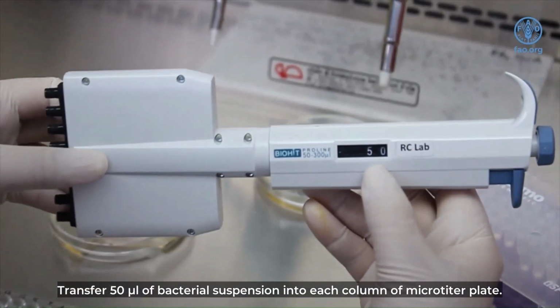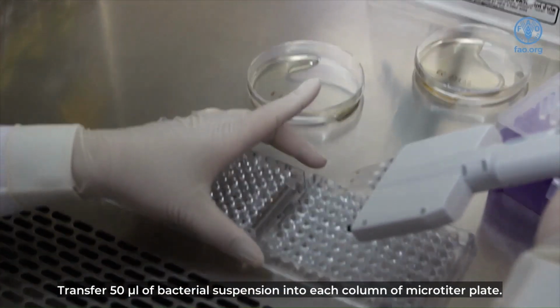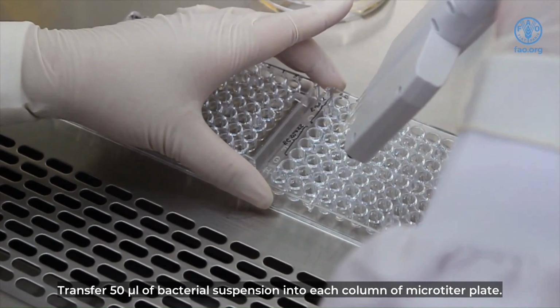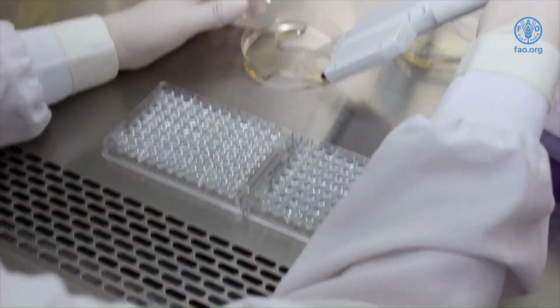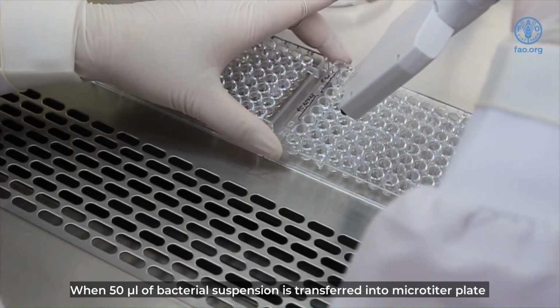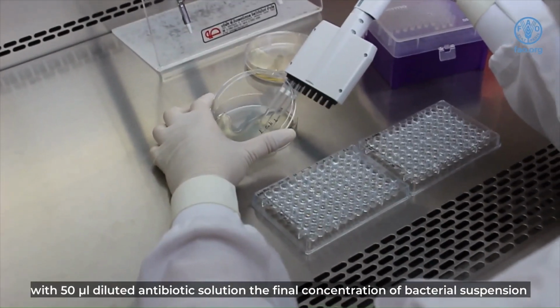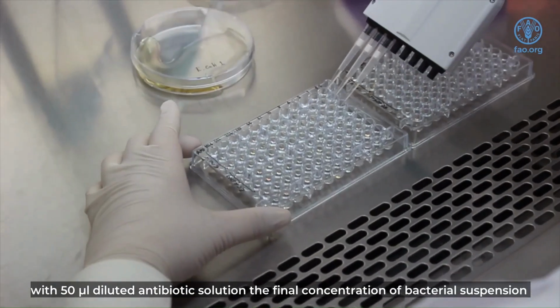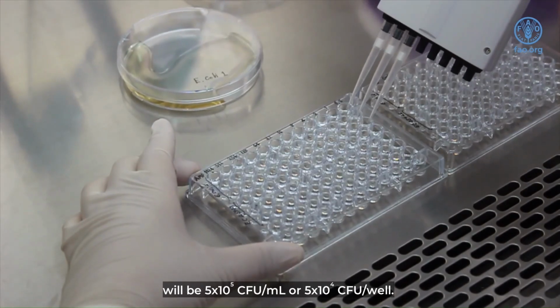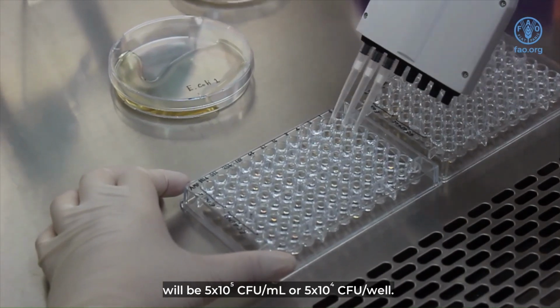Transfer 50 microliters of bacterial suspension into each column of microtiter plate. When 50 microliters of bacterial suspension is transferred into a microtiter plate with 50 microliters diluted antibiotic solution, the final concentration of bacterial suspension will be 5 times 10 to the power of 5 CFU per milliliter, or 5 times 10 to the power of 4 CFU per well.